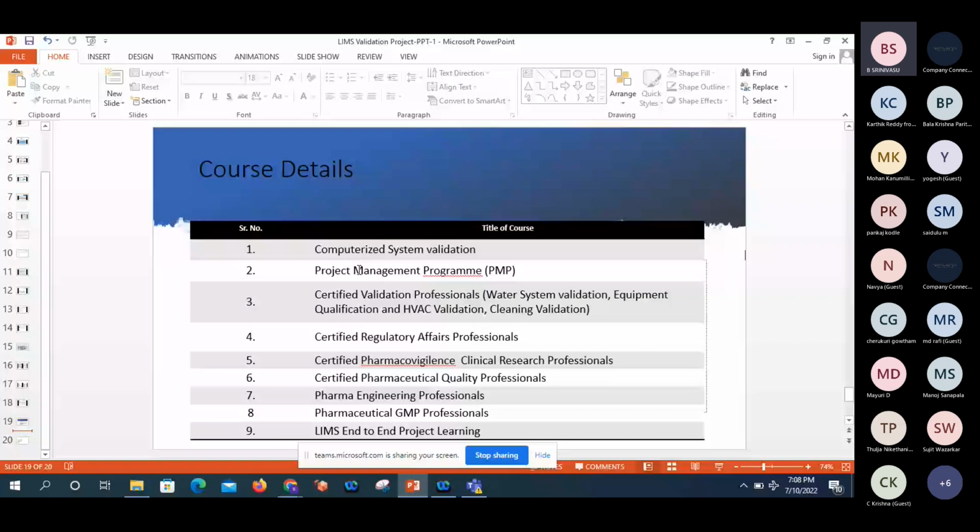Whatever activity we do, like entries, goes in the activity log. Maybe you are checking only the user log. The user log may open before the date change, but activity can be done after the date changes. That is different. Yes, sir.